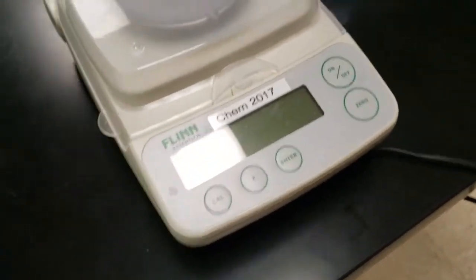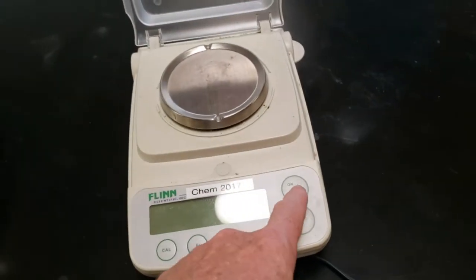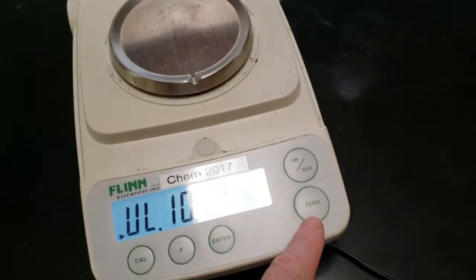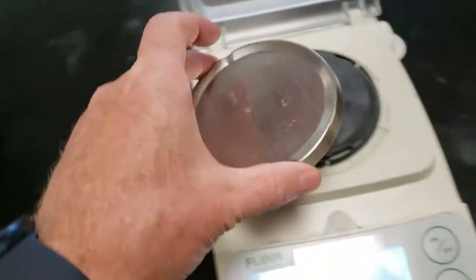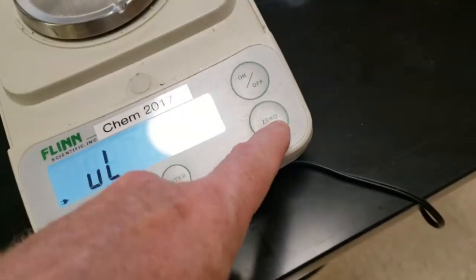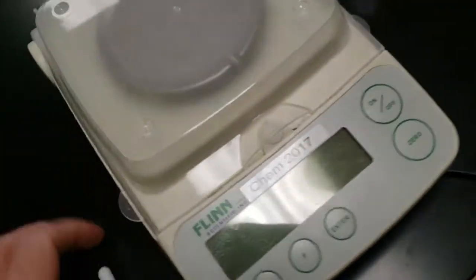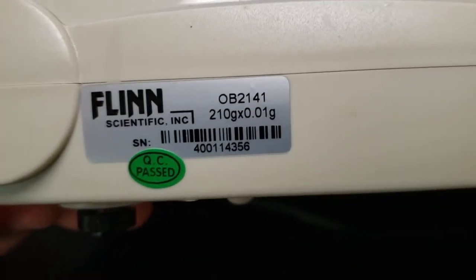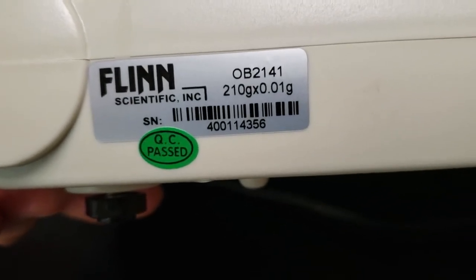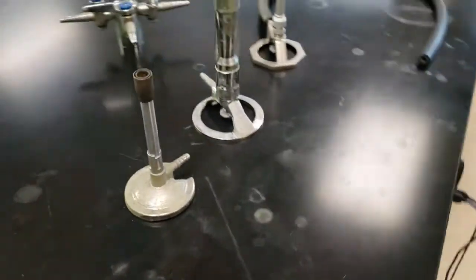Here's an electronic balance. Flinn makes this one. To weigh something, you pull the top up, you push on, and you let it zero out. You have to be patient here until it finally turns to zero. If you got stuff on there, you can take the metal top up and wipe it off. Don't wipe it while it's on the scale. Take it off the scale first, and then you can push zero to make sure it goes to zero. On the side, you find information like the maximum capacity of 210 grams for this one and an uncertainty of 0.01 grams. Above is an order number that will be important when we have the materials list.